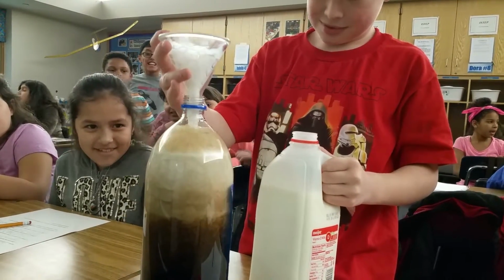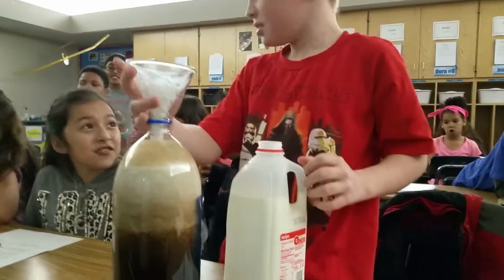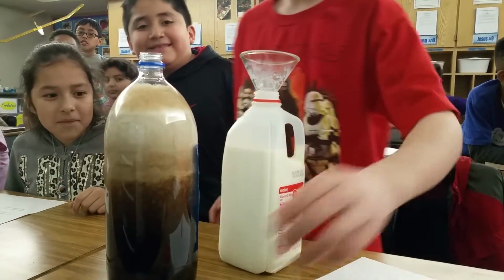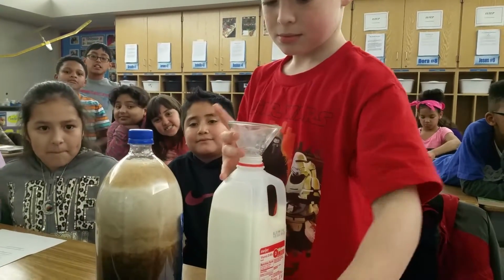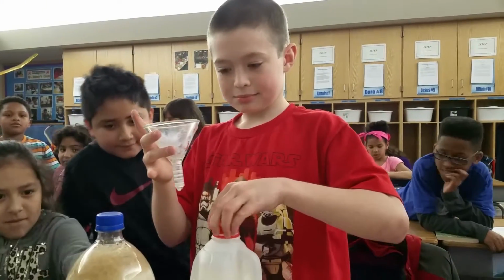Okay, let that run down. You can shake it a little bit there. There you go. All right, now put the cap on. Corbin, we're gonna let this sit, and we're gonna come back to this after we use our centrifuge, and we're gonna see how that colloid separates out into its parts.